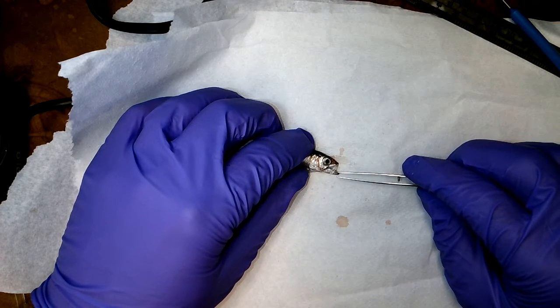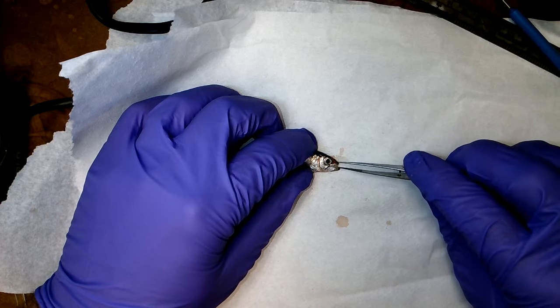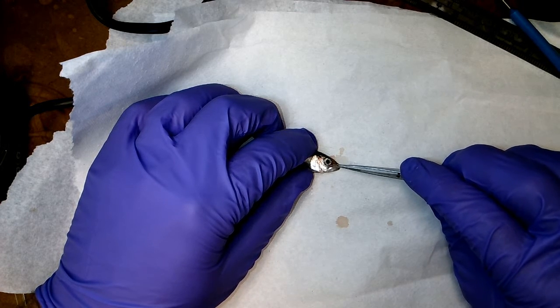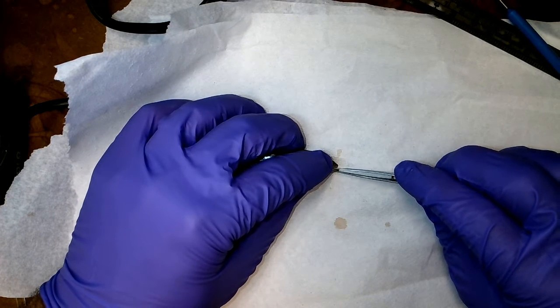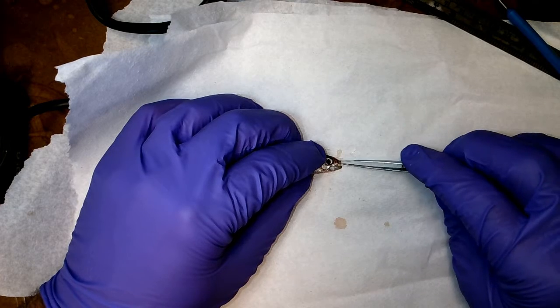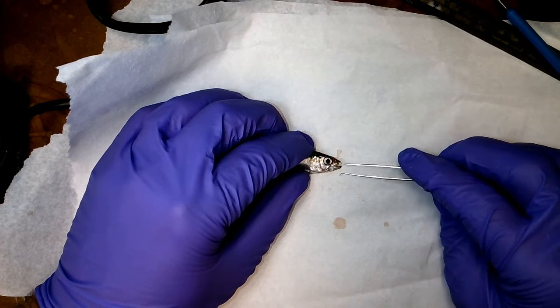Open the fish's mouth, and for the purposes of this, I'm going to remove this fleshy tissue here so you get a good look at this.